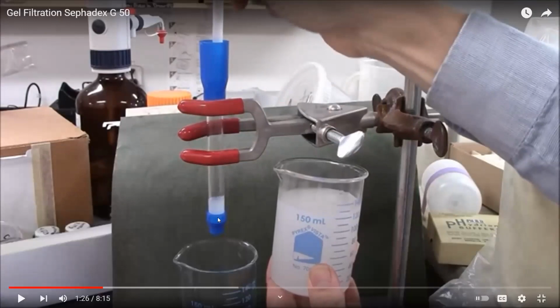So the column already has a glass wool or a cotton plug at the bottom. So that's why he's able to add it. If there was no blockage below, whatever material you add from above will just trickle down the column.